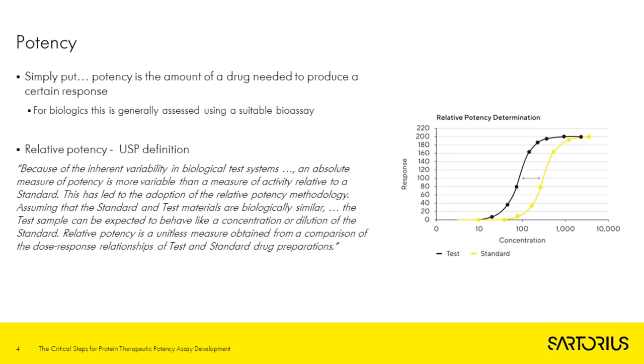So a key part of the assessment is the potency of the drug, and simply put, this is the amount of drug that is needed to produce a certain response. And for biologics, we can assess this using a suitable bioassay. And when we talk about potency experimentally, we're generally referring to what's called relative potency. So this allows for the inherent variability within the biological system, so for example within our bioassay. So to account for this, we measure the potency against a standard, which is constant between the assay runs.